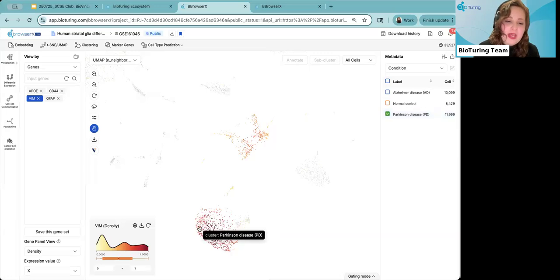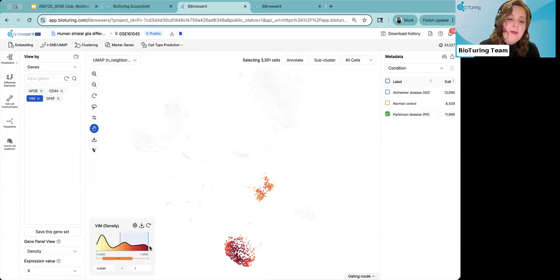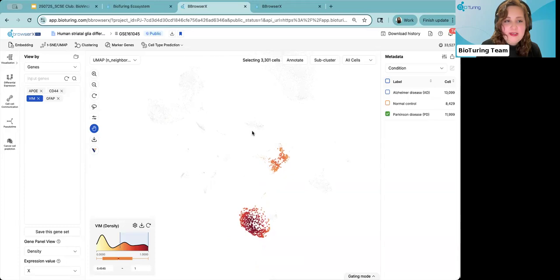Another way you can look at these specific scores is if you save or label specific density thresholds, you're able to create an annotation based on that density score for that gene. That way you're able to visualize it either as a violin plot or as a, not a bubble heat map, but also looking at differences in summary. So how do these scores differ, or the proportions of these scores across the conditions? That's one way you can start running this type of analysis within the system to identify these differences across different astrocyte populations in this case.